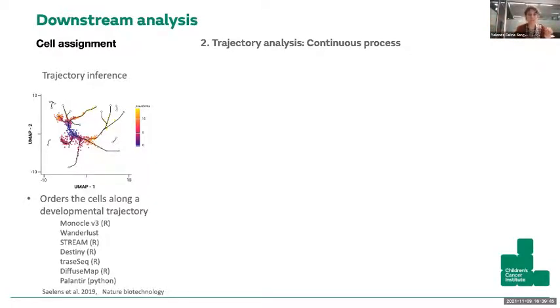Or based on, I know which cells are stem, which cells are more differentiated because of the markers, and then you can say, okay, so this is a stem, this is differentiated, that's the direction. But the trajectory analysis doesn't give you the early time point unless you do have an early time point or you know what happens first.